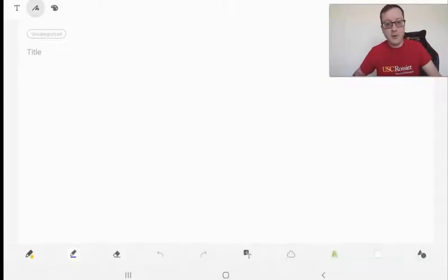Alrighty, we're going to do carbon NMR. It'll be a nice short video because carbon NMR is thankfully much easier than proton NMR is.